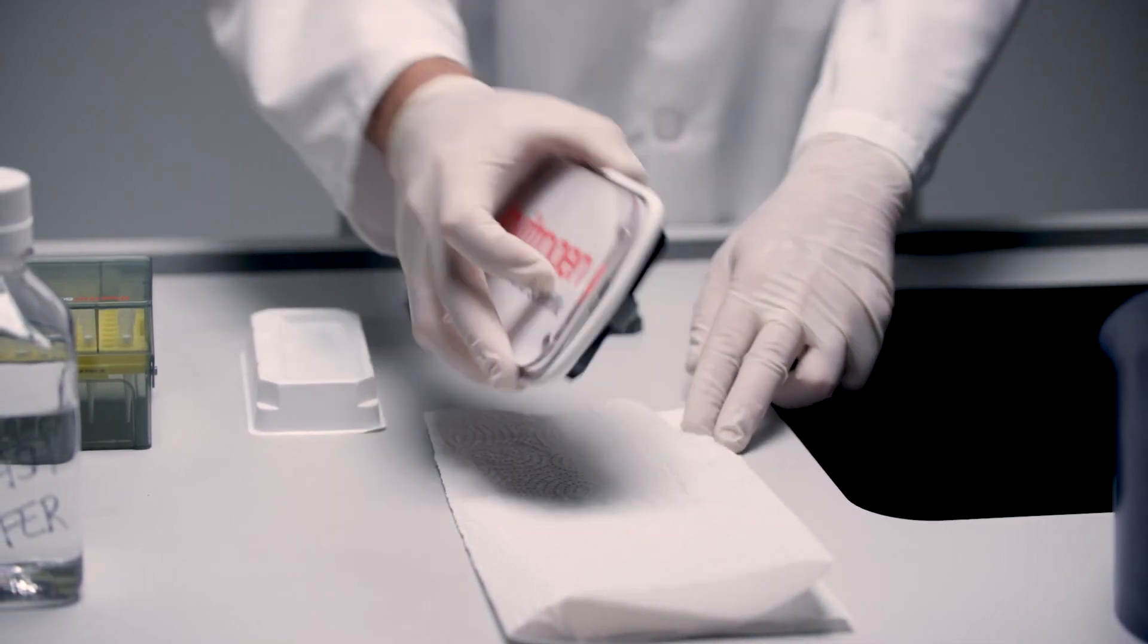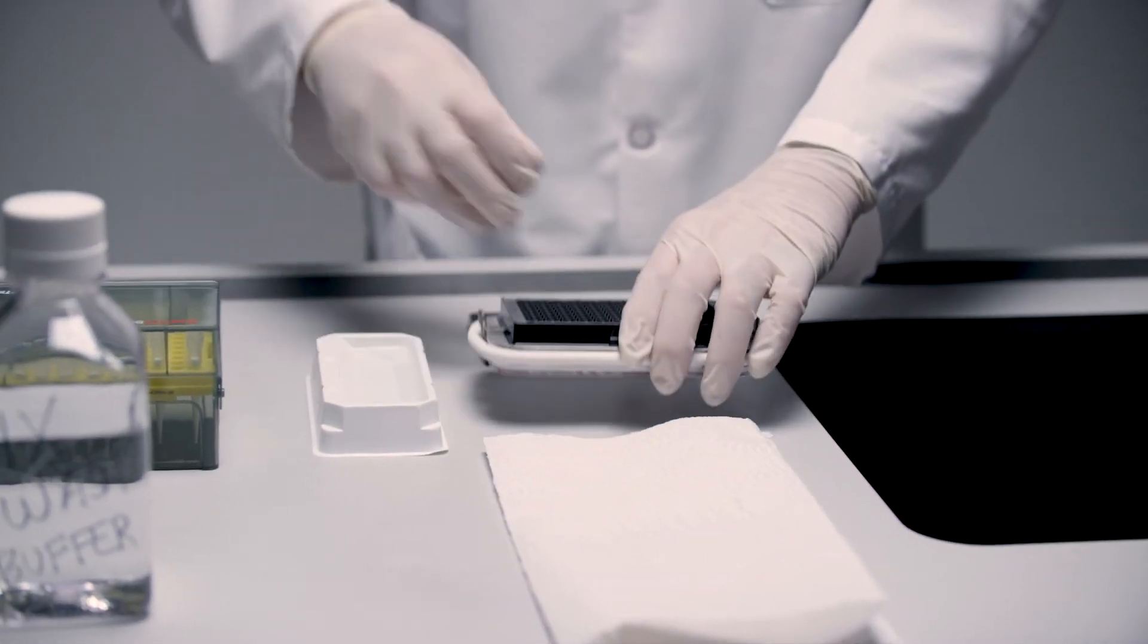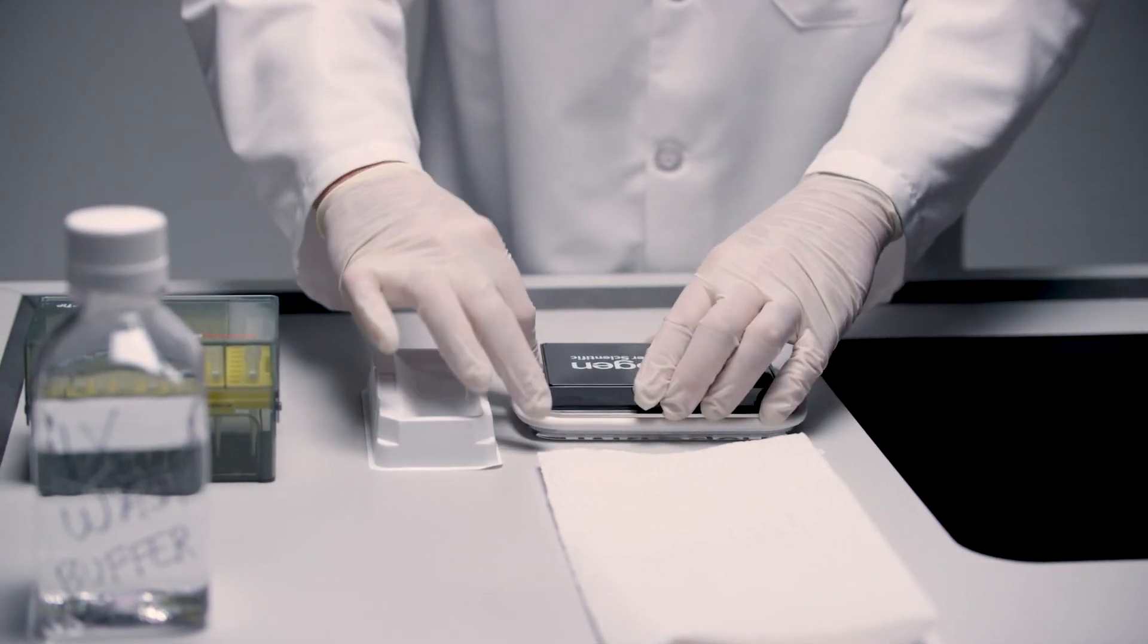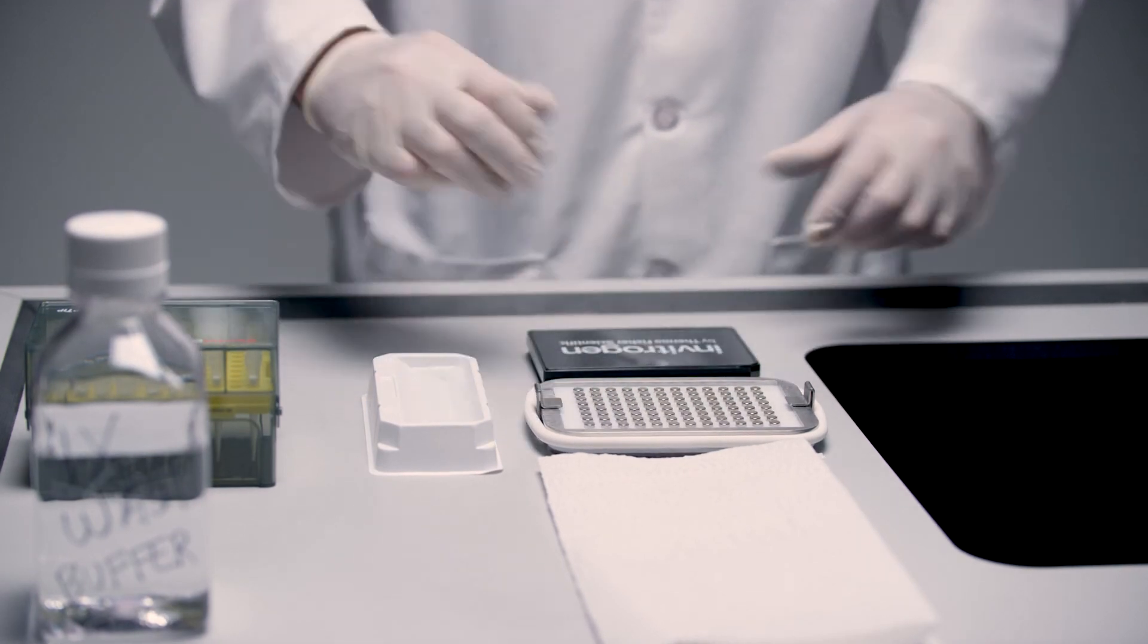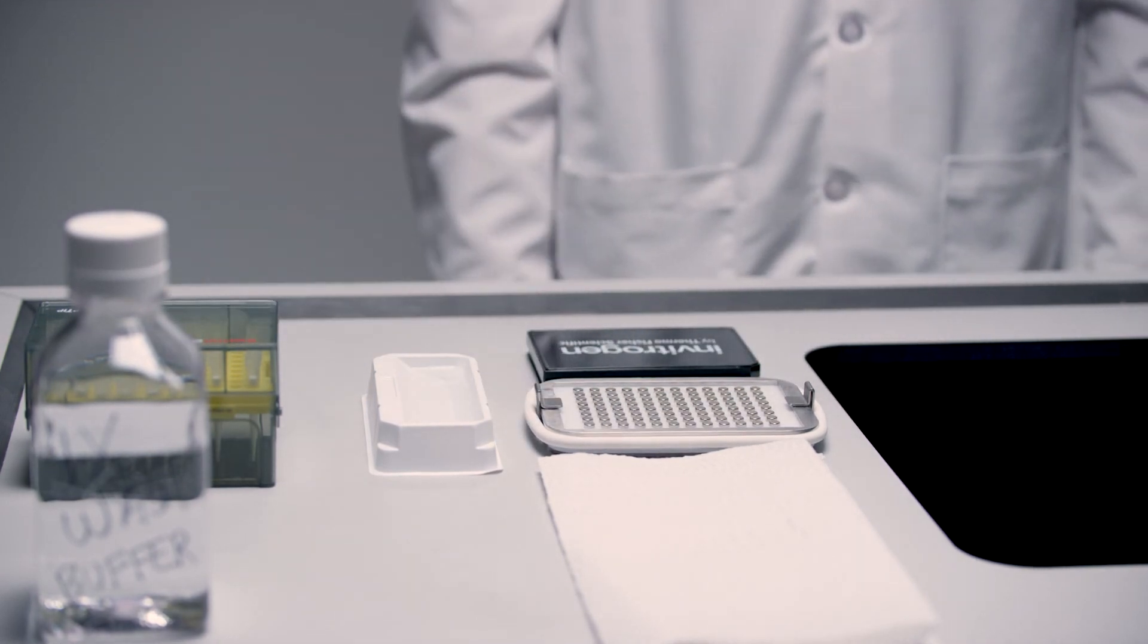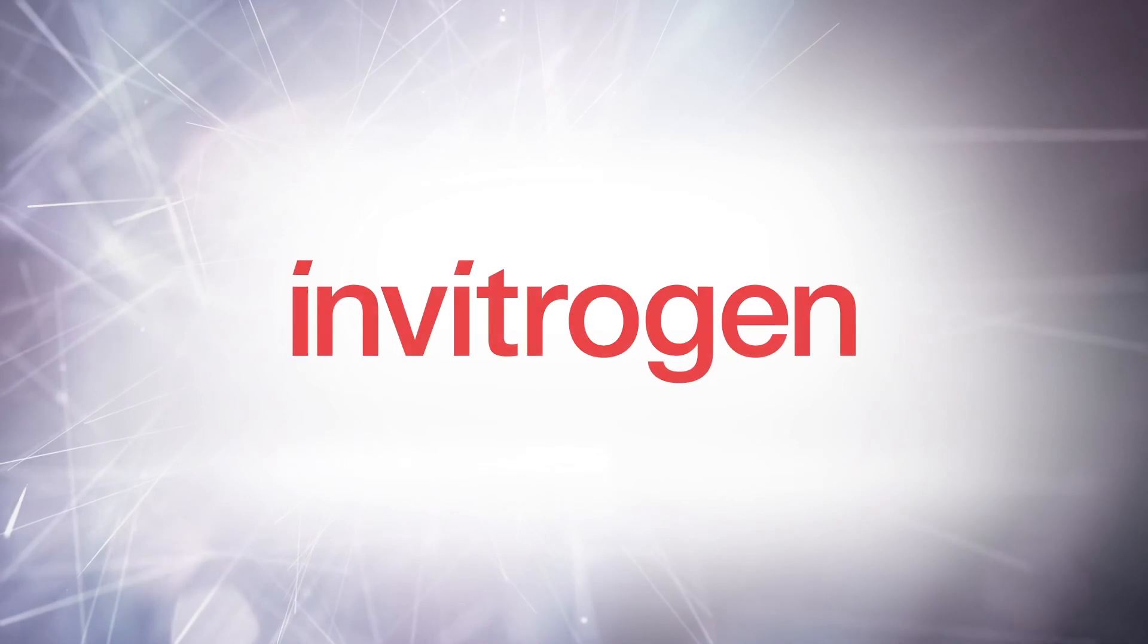Repeat the wash steps according to the user guide included in your assay kit. After all the wash steps are completed, remove the plate from the handheld magnetic plate washer and proceed with the protocol.